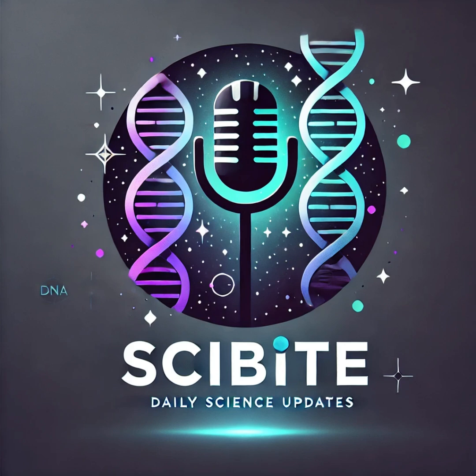XLDOT can provide this 3D map of a material structure at the nanoscale, which opens up so many possibilities for innovation. It's like having this brand new, powerful lens to look at the building blocks of our world. Makes you wonder what other breakthroughs are possible with this level of insight. The possibilities are really amazing. I mean, imagine being able to study the structure of biological tissues in way more detail than ever before, which could lead to all sorts of advancements in medicine and healthcare. Or maybe we could even figure out the secrets behind these complex things in nature. That could lead to new discoveries in fields like energy and environmental science.